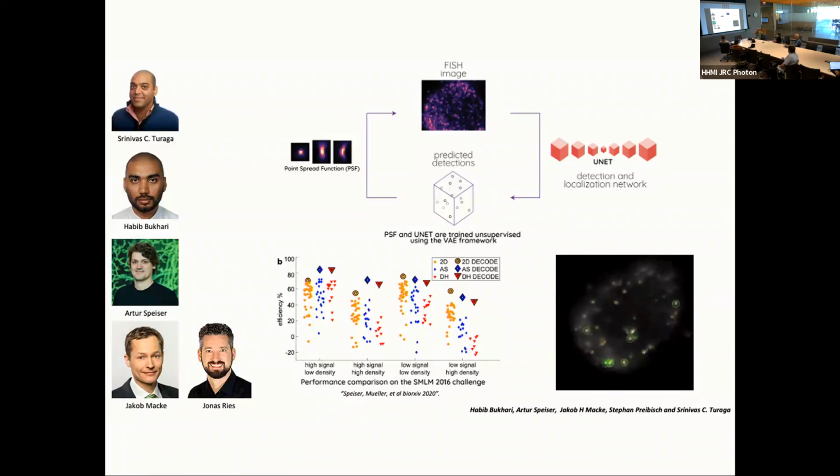Usually you have a latent space where you train to compress your image into a small representation, from which you recreate the image. What it basically did is that the decoder is a physical simulation, which in this case is easy because it's simply applying the transfer function to the locations of the points, and that's the decoder. And then the encoder they actually trained. So what the encoder gives you is actually the location of all points that allow you to recreate that image. And that's a very powerful approach.